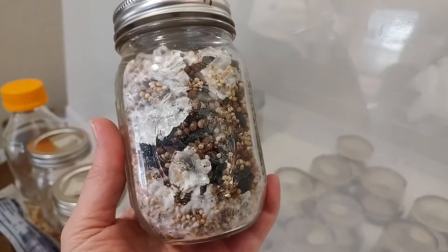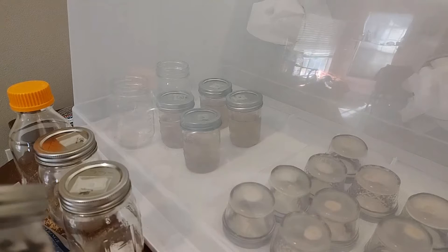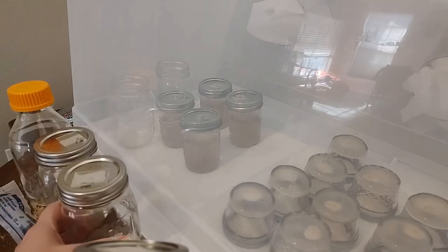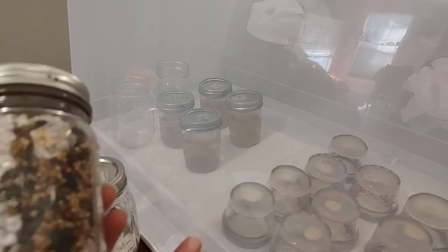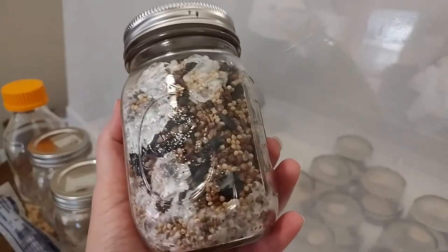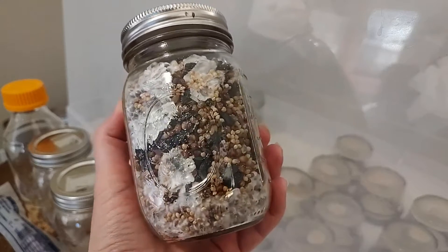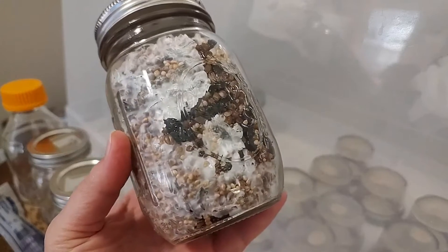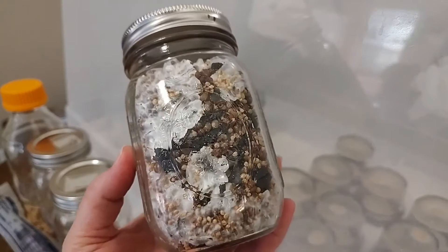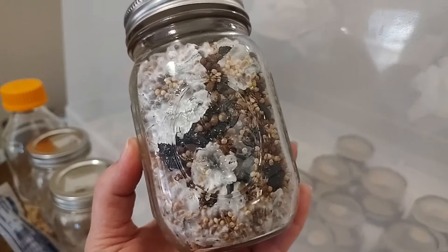When we start at the beginning with spores or liquid mycelium — whether it's the LC liquid culture, the slurry we're creating, or agar transfers — you create the liquid culture and slurry out of the agar plates. You can put agar straight to your bird seed or your grain, whether you're using bags or jars, to grow as well as the liquid culture and slurries.